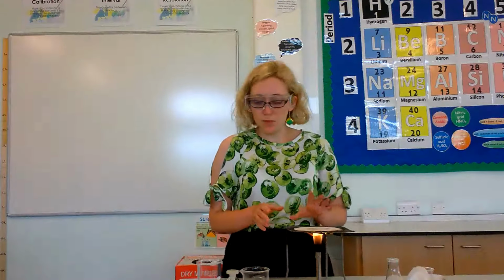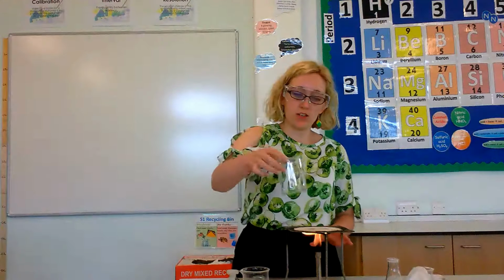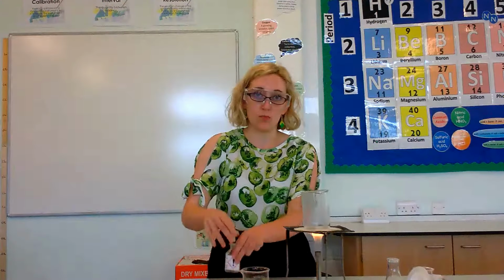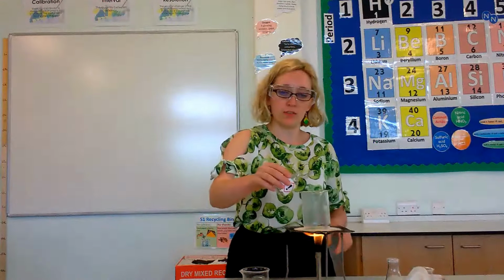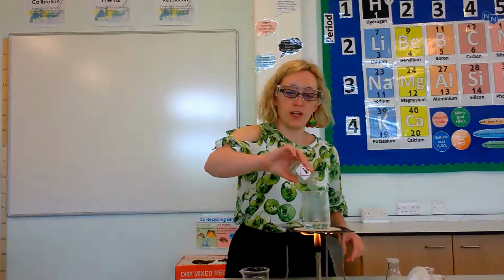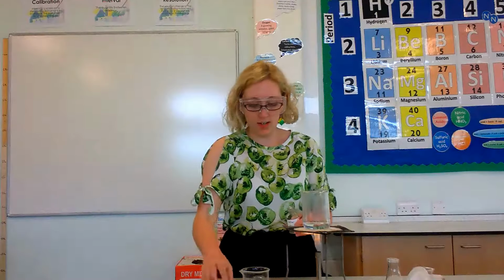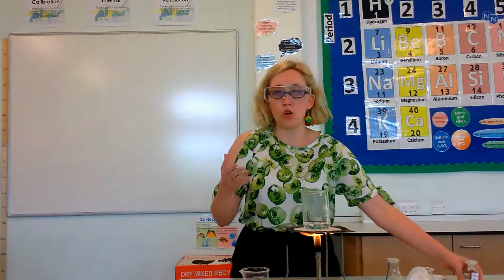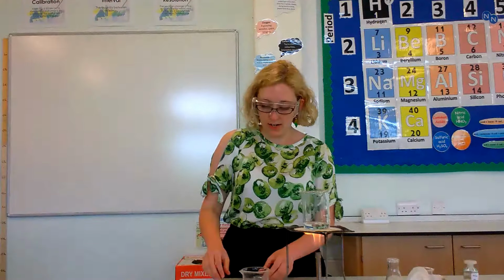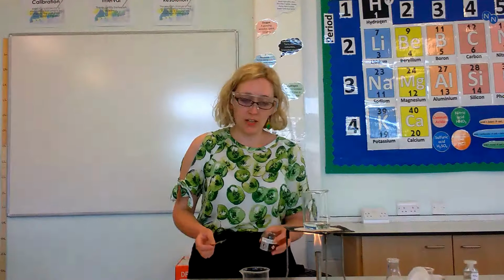So the first thing we're going to be doing is heating up our acid. So you pop your empty glass beaker on there. We're not going to put it empty for too long on our Bunsen burner, otherwise it can crack. Pour all of your acid in. Now the point of heating up our acid is that it ensures that more copper oxide powder will dissolve in it. We want as much copper oxide powder in here as possible.